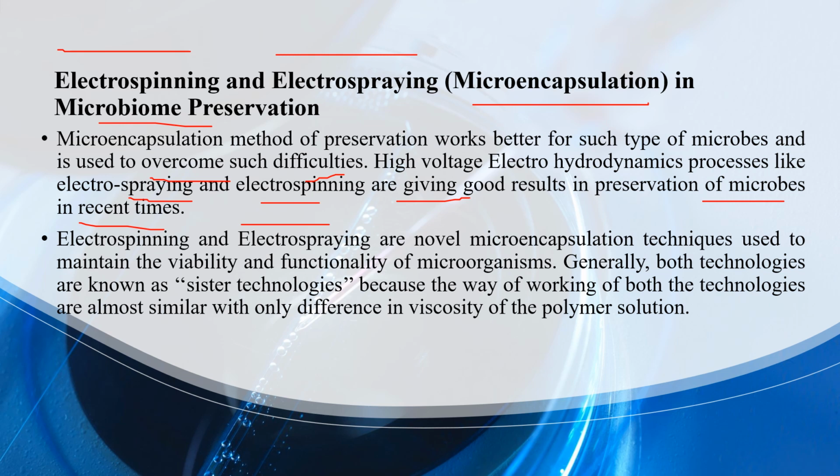Generally, both technologies are known as sister technologies because the way of working of both is almost similar, with only differences in viscosity of the polymer solution.